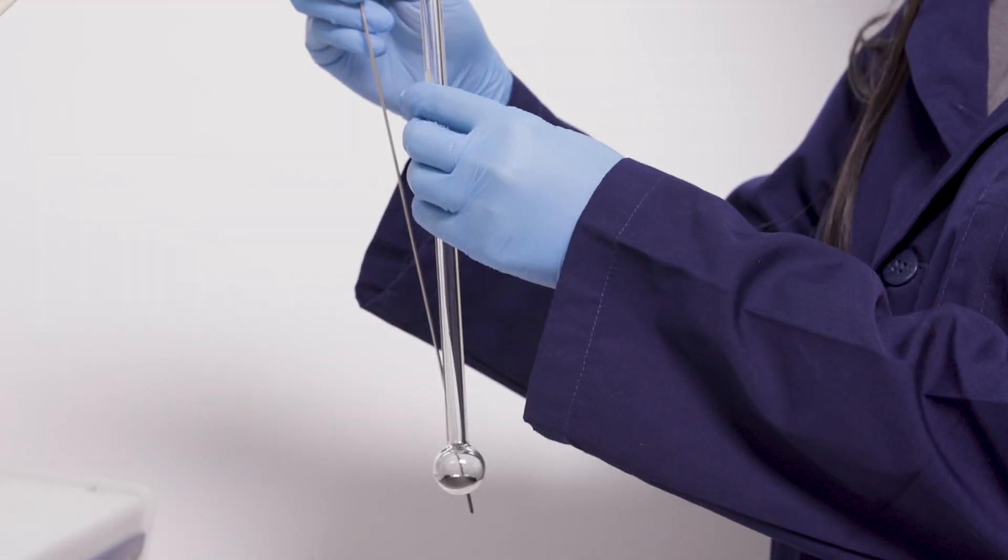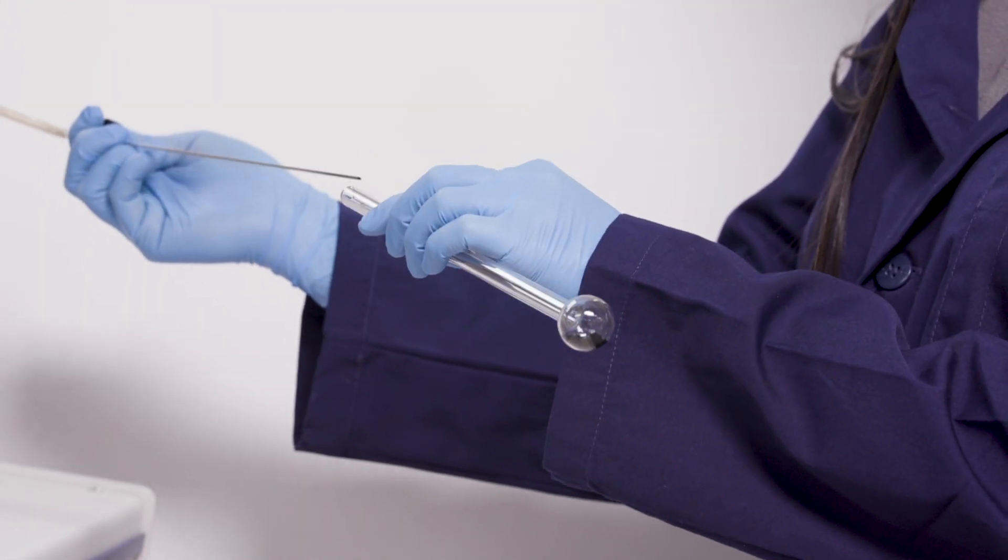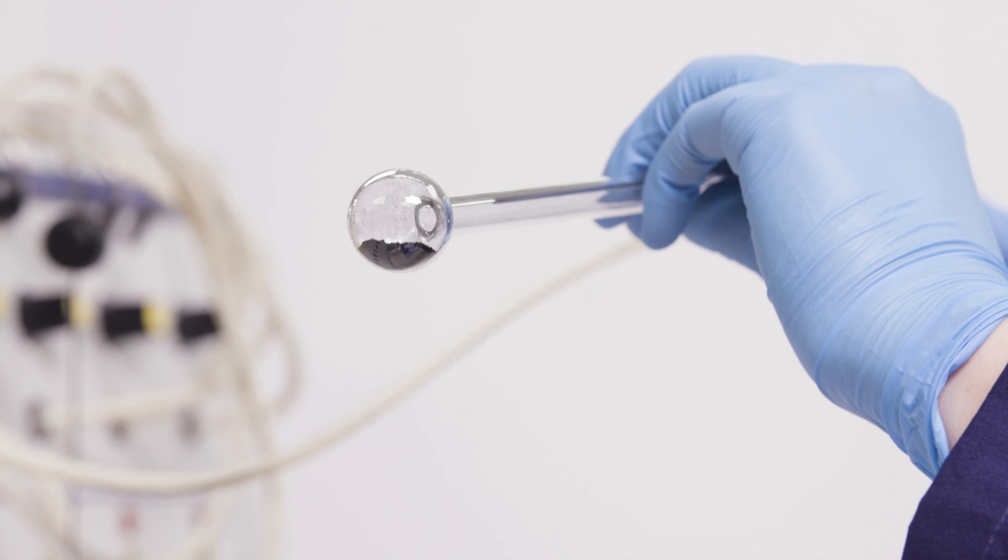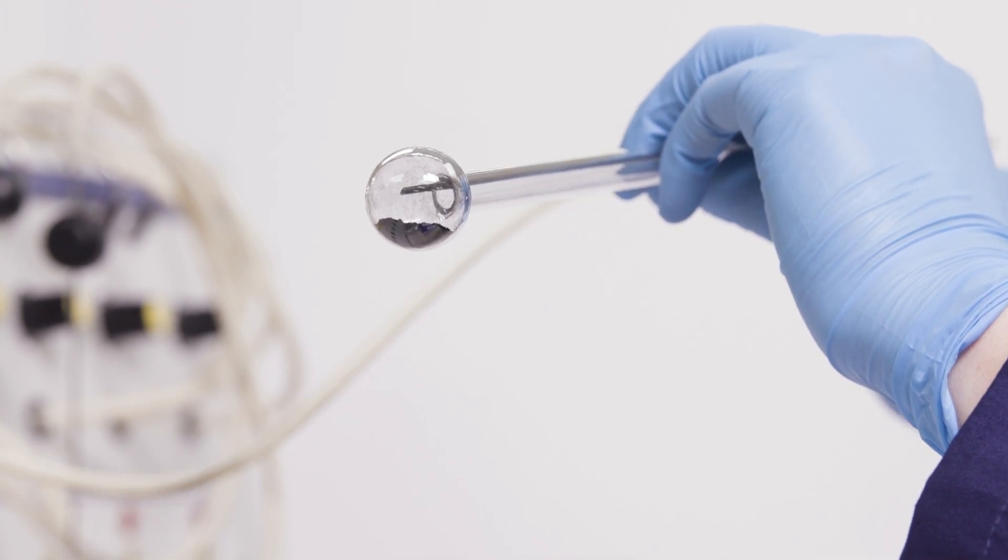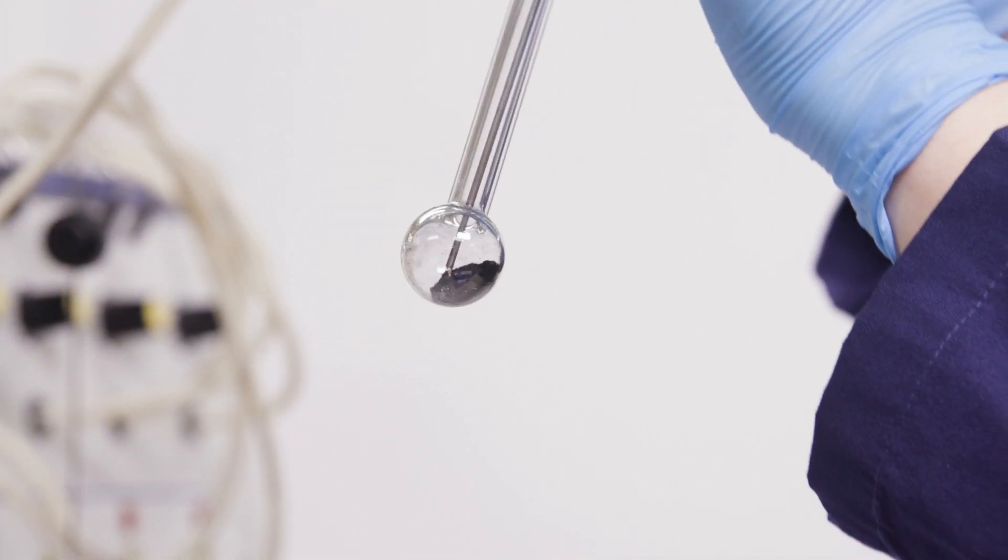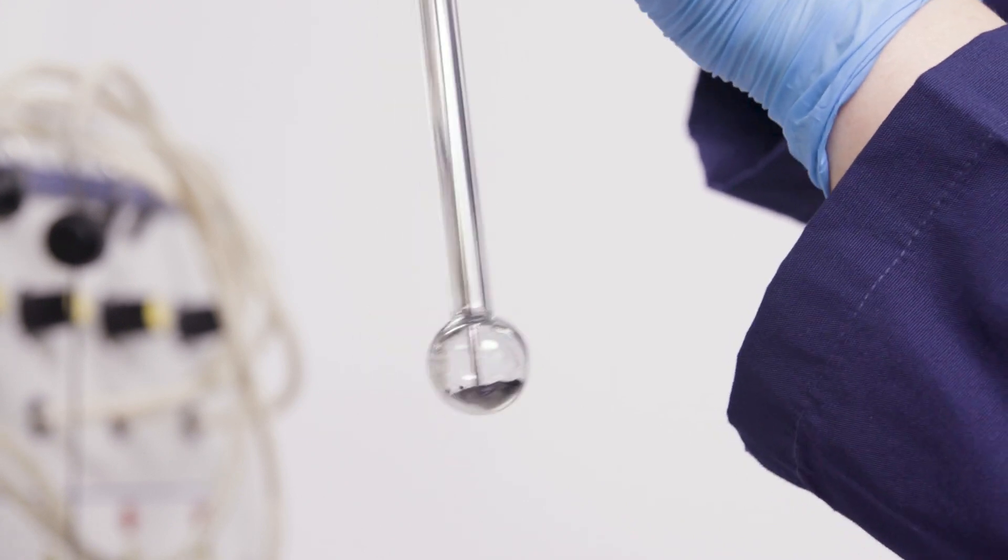When using the flow degas method, make sure to insert the probe all the way to the bottom of the sample bed. Tilting the sample tube can help to insert the probe without touching the sample to prevent clogging the probe.